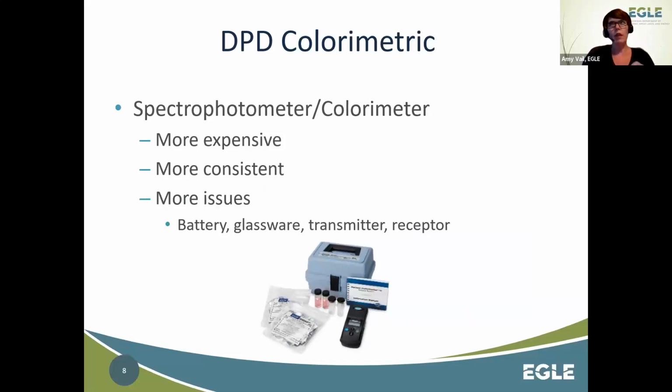There's a mid-range that is like a 0.05 to 4, I think. And that uses 25 mil pillow packets, but still 10 mils of sample.